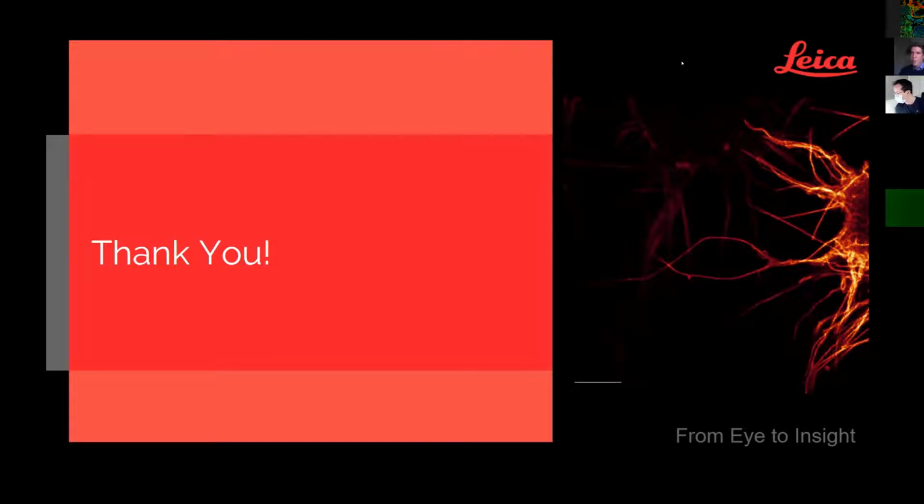Okay, so there are other questions. So the second one is how Tau-STED allows you to lower the laser power needed. So if you can say a couple of words. Yeah, so we're going more into the direction of how this is possible. And if you remember, I briefly showed in the beginning that as we are now measuring the lifetime distribution in parallel to our normal scanning, this gives us the opportunity to discriminate between the very center of the STED PSF as opposed to the periphery. So the more you go to the center of the PSF, the less affected those lifetimes will be by the STED laser actually, which means that those are the ones which have the highest resolution. Yeah, at the same time as the one with the longest lifetime.